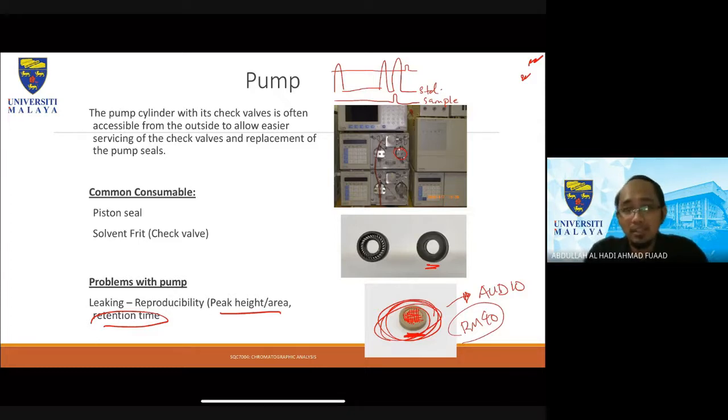Therefore, if it's about disease, you could say this person is free from X disease, while in reality it's because of improper management, or you're not running preventive maintenance, and that's affecting the performance of your HPLC system and the results analysis, and therefore you can actually affect human life.